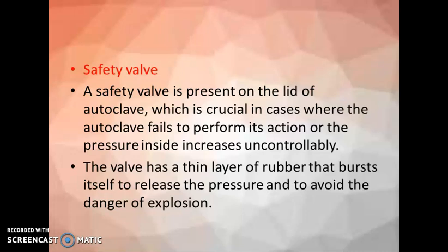The valve has a thin layer of rubber that bursts by itself to release the pressure and avoid the danger of explosion. The safety valve is necessary.